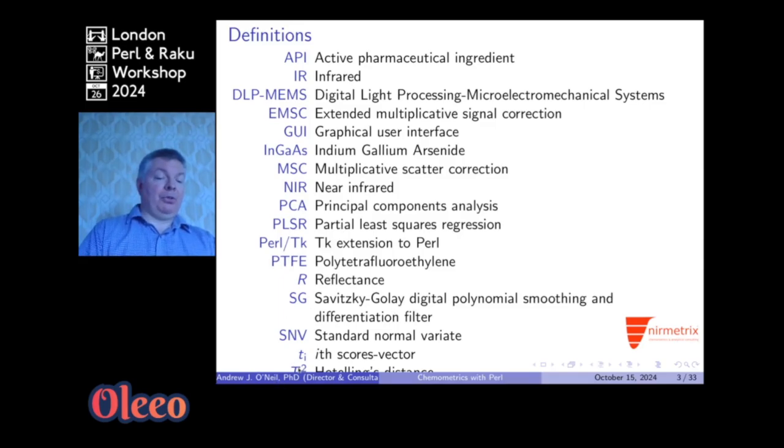T-squared here is just missing from the slide. My apologies, because I've used LaTeX and it's chopped off. T-squared is the distance in the pattern space that we use to determine whether a particular projected spectrum falls within the usual cluster of data points. And if this value exceeds a critical value, then we can say the spectrum doesn't belong to the class, reject it and say it's not a match.